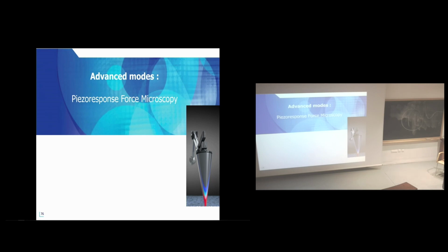Okay, second advanced mode. Yes. Speaking about probe size, is it doable to deconvolute the tip size and try to understand what's the... You are this kind of guy. No, I don't know if it's possible. Probably, but you have to know perfectly the tip. I don't think you can tell. I haven't tried. I'm not this kind of guy.